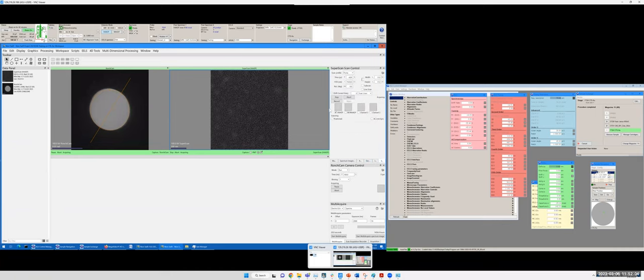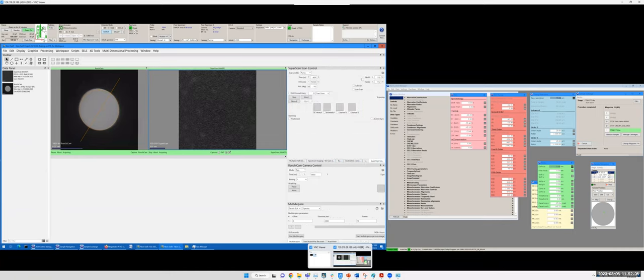Super scan control. Those are the parameters. Scan profiles such as Puma, Rabbit, and Frame just store different settings under those names. For example, for Puma, you can have a pixel time of 4 microseconds, frame of 512 by 512, and field of view of 1000 nanometers.